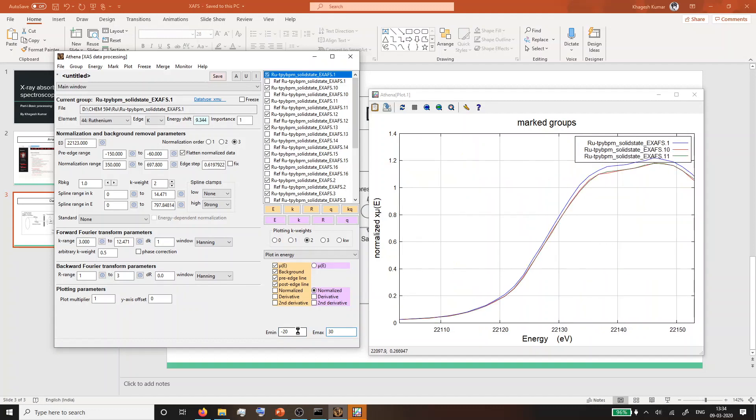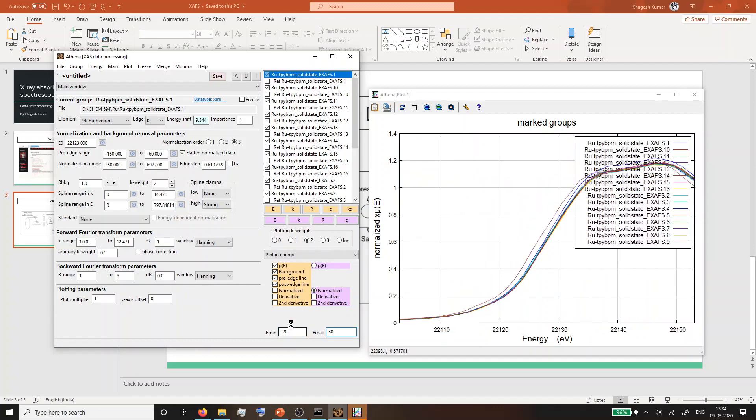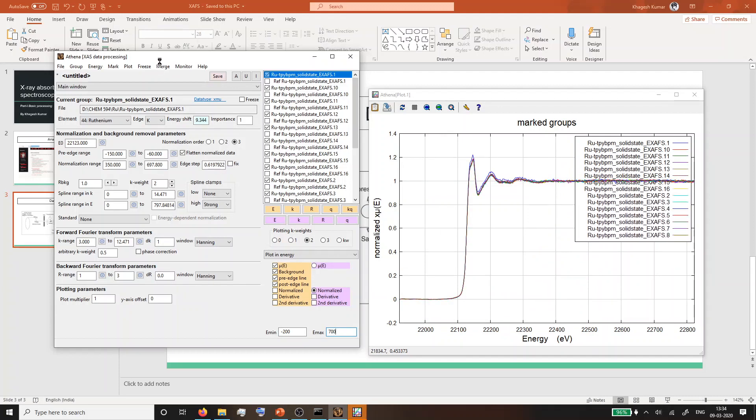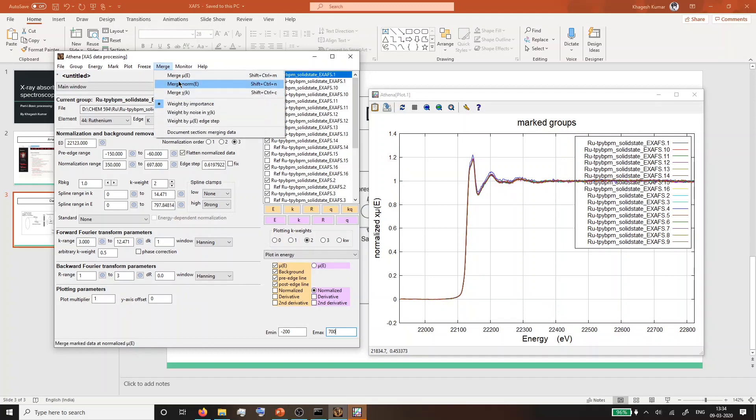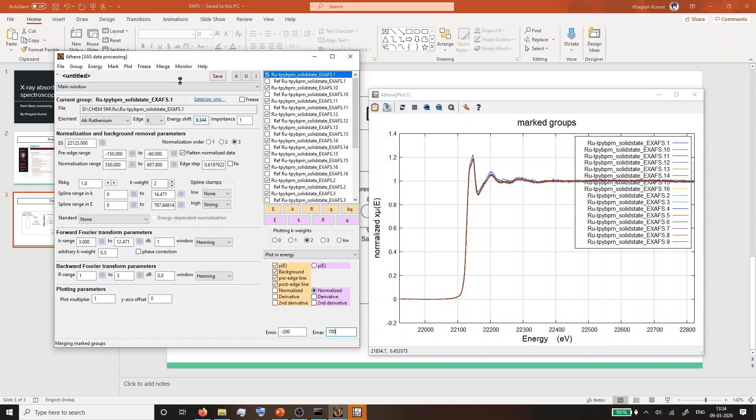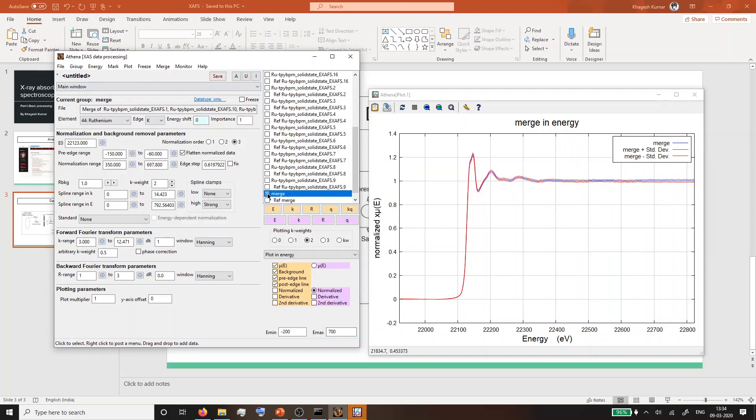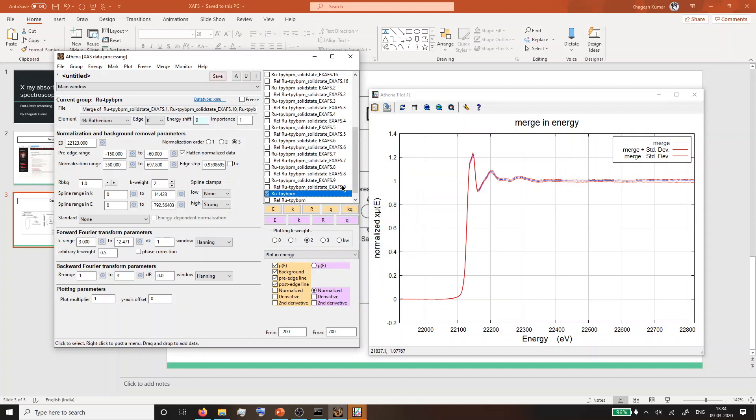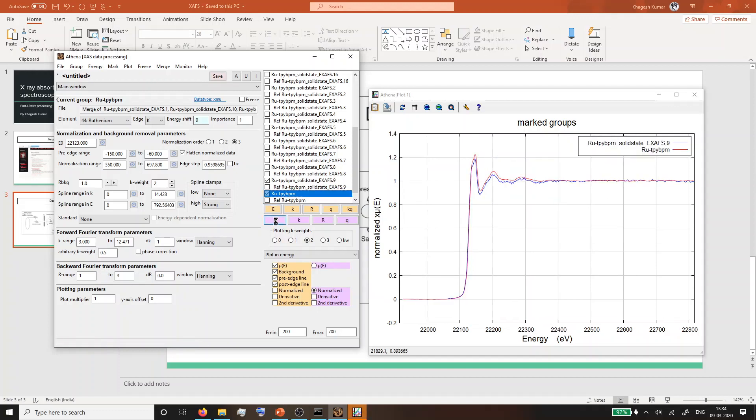Once you've checked the XANES region, you can go ahead and merge all the spectra. Now this data has far less noise than any of the data collected previously. This is a single dataset collected previously, and the red one is the processed merged data.